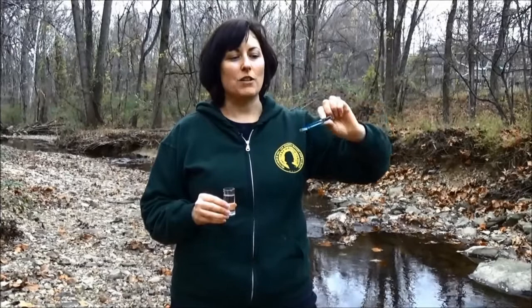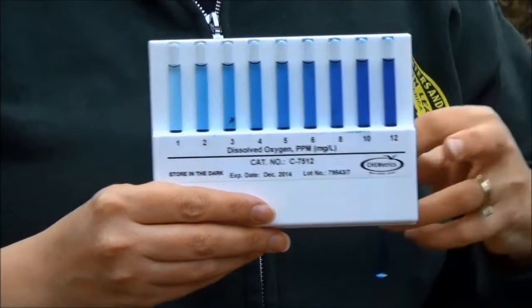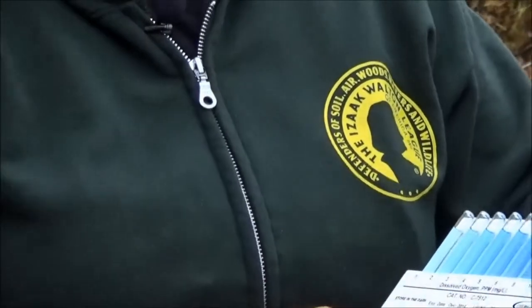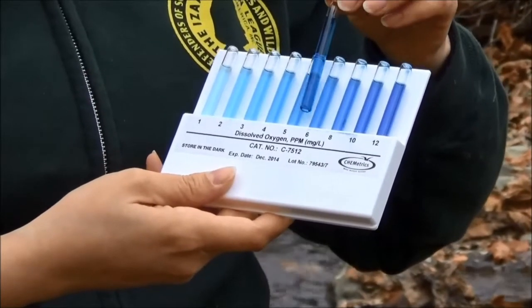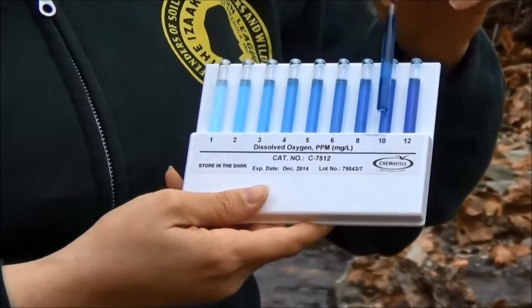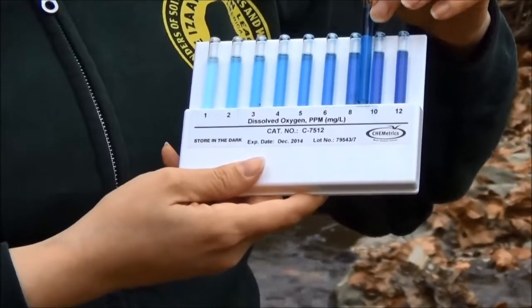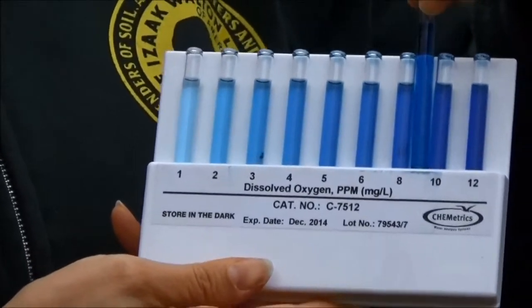At this point water has gone up into your ampoule, and you just want to turn it up and down a few times to allow it to mix. This is going to perform a chemical reaction that will change the color, and for this one you want to time it for two minutes. After two minutes we'll take this reading using our color comparator. It's definitely a lot darker than the ones on this end, so we'll call this 8 parts per million of dissolved oxygen.